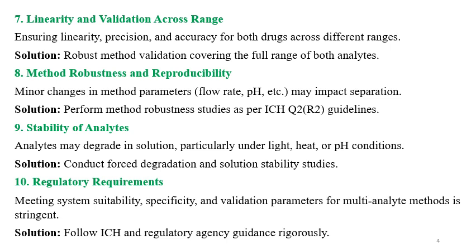Seventh is linearity and validation across range. Ensuring linearity, precision and accuracy for both drugs across different ranges. Solution is robust method validation covering the full range of both analytes.